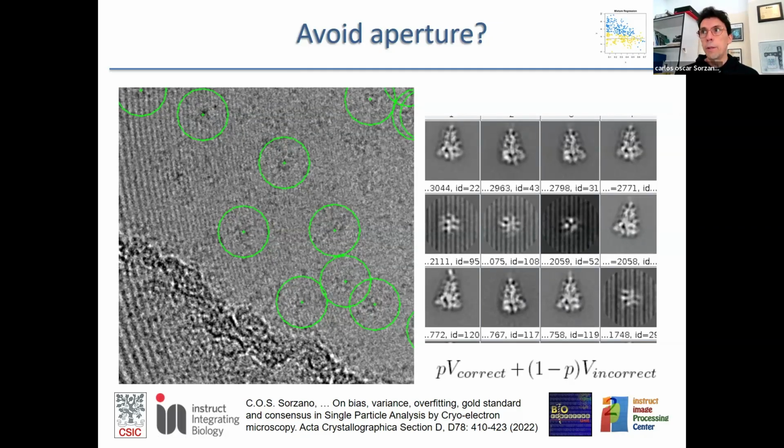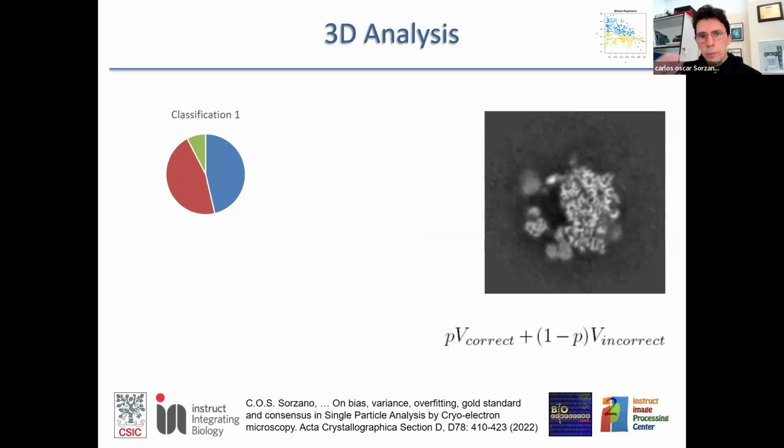And that is where Scipion helps a lot, because it allows you to execute multiple algorithms to solve the same problem and to compare their different outputs. So this is another example. This is a 3D analysis of your structure. So this is a ribosome. You collect, I don't know, 500,000 images of this ribosome, and then you try to classify, to identify if there are multiple states of this ribosome. And one algorithm that is not crazy, this one is very much used in the field.